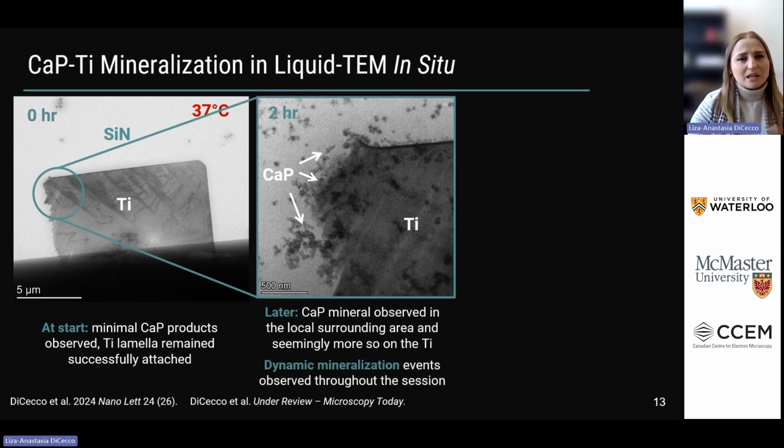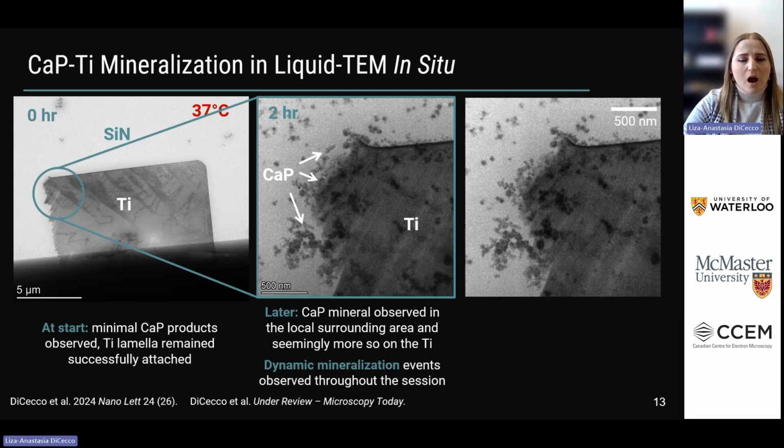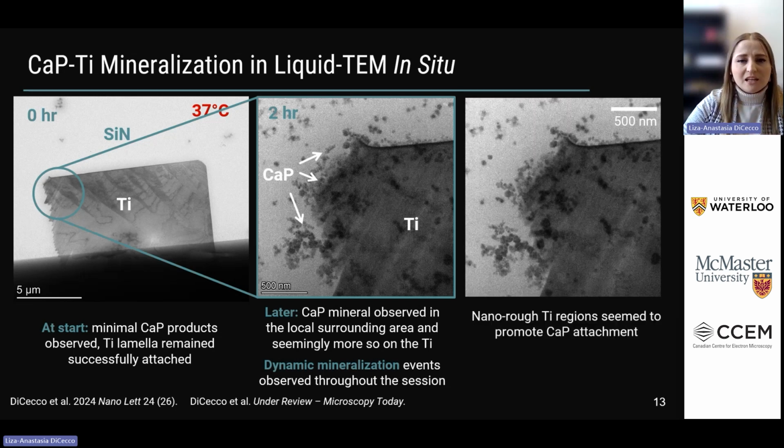At later points, we heated it at 37, observed mineralization events, and we could see that minerals started to form in the local surrounding area, and more so seemingly on the titanium lift out. So that was really exciting. We were able to capture dynamic mineralization events throughout the whole session. This is just a snapshot video covering about a minute or two of imaging, but it's highlighting that we have active movement and there's even biomineralization events happening on the surface of the titanium.